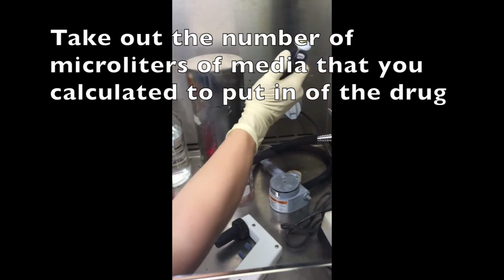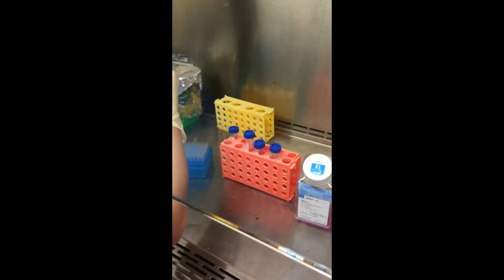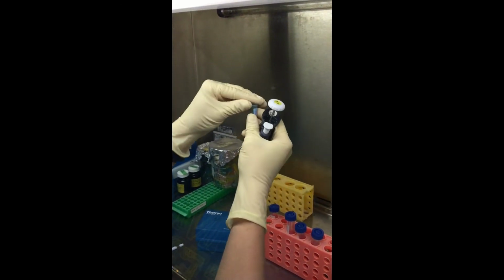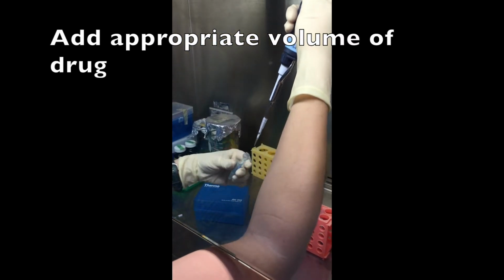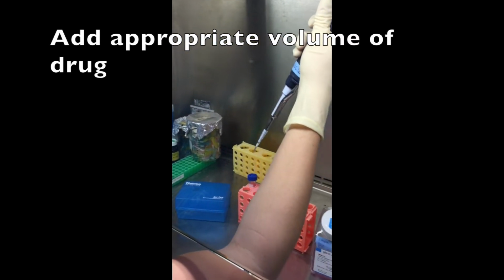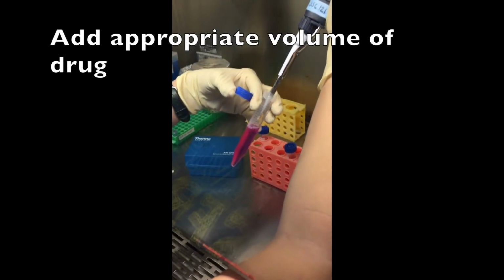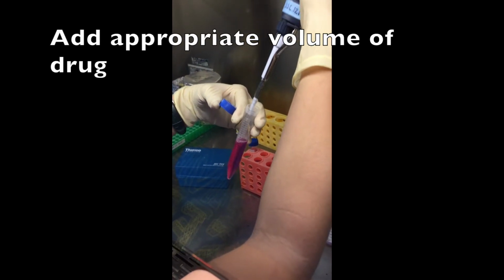So I'm just going to eject the tip with the media into my beaker. Then I will make sure my drug's all mixed up. Take out my 16 microliters. And when you put it into the tube, make sure you're in the media and go up and down a couple times to make sure all the drug has come loose.